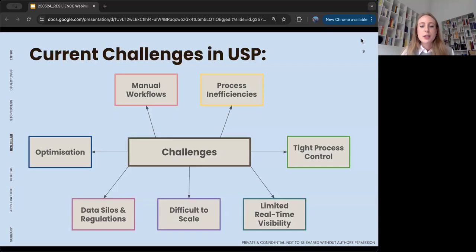Small changes in conditions like temperature, pH, or oxygen levels can have a significant effect on cell health and productivity, making batch consistency quite difficult. So this can eventually lead to variable product quality or even failed batches, which again is a major risk in regulated environments like pharmaceuticals.